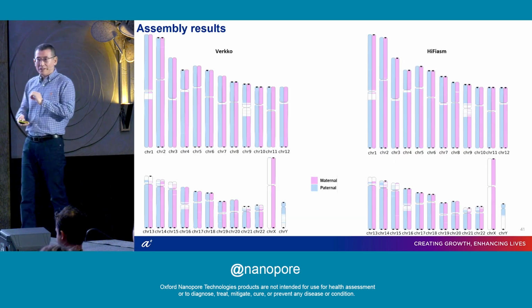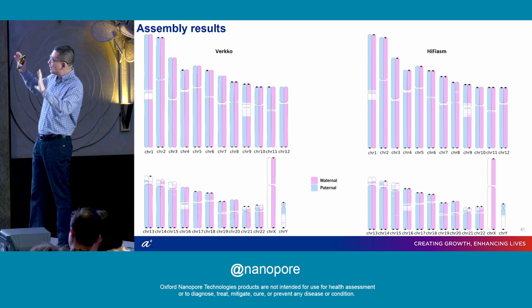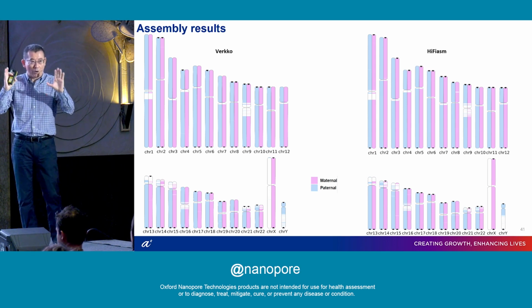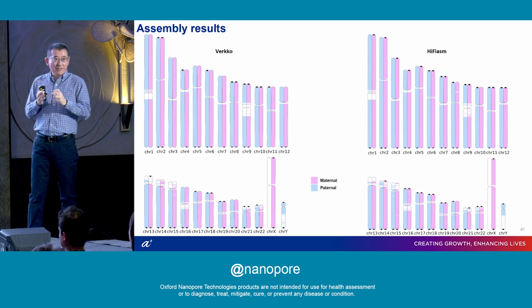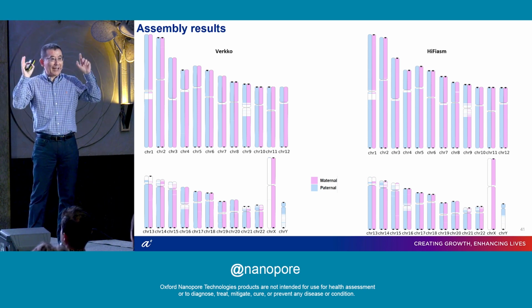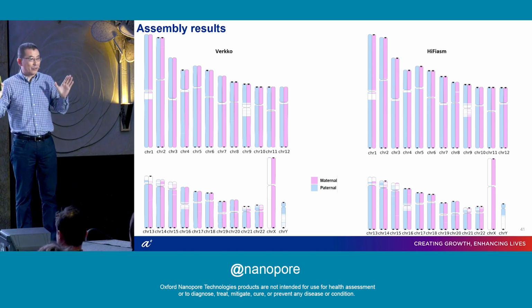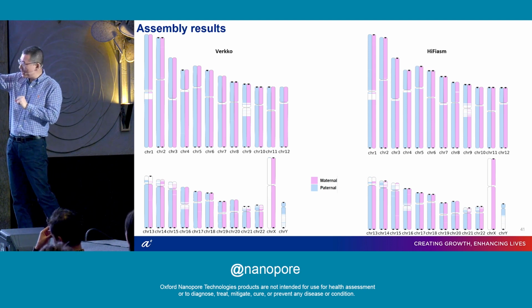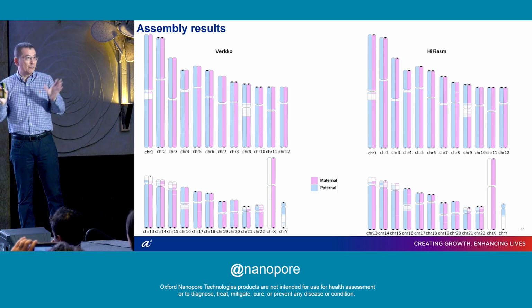There's another way to look at what's called the T2T view of this chromosome, right? On this plot, the color represents the maternal and the paternal chromosome, and whether they are resolved. If there is a white color, it basically means that piece of sequence has not been resolved. We call these gaps, okay? And you can see all the centromeres still remain unresolved. And for many of the acrocentric chromosome tips, where the rDNA clusters are located, they still have largely not been fully resolved either.